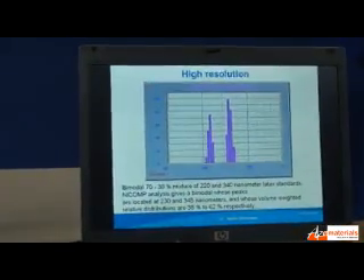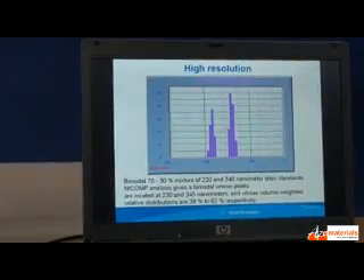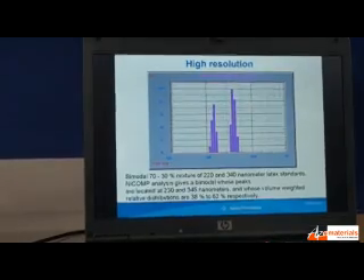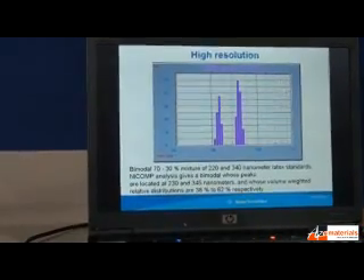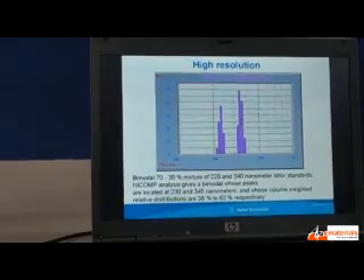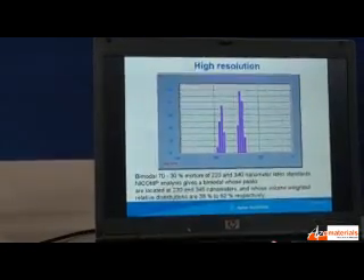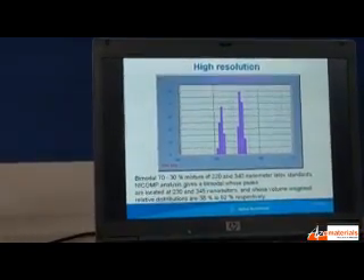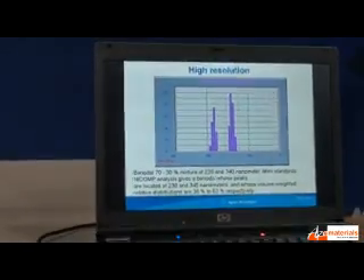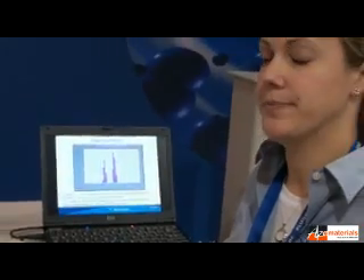This is highly used in research and development — it's in universities and many different research labs. There are a few that actually have the capability of being online. Each piece of equipment is built per customer, so if you have the need for higher resolution or a smaller size range, we can always put a better detector and a better laser in it for you, as well as the capability of Zeta Potential. So it's all completely modular — whatever works for you, we can do.